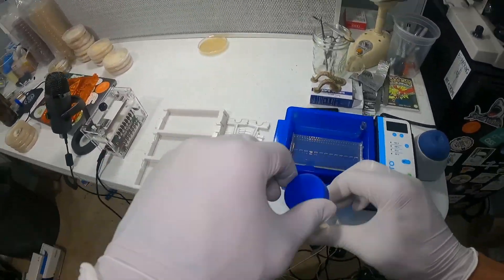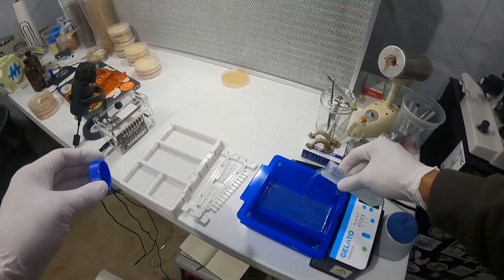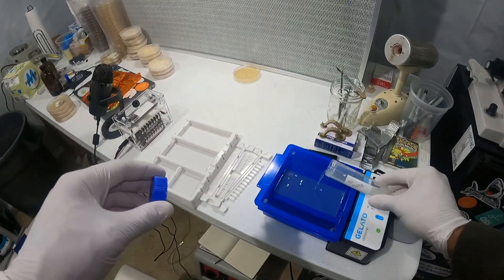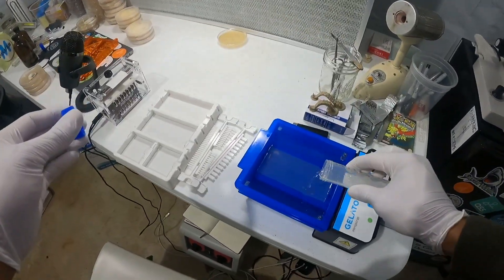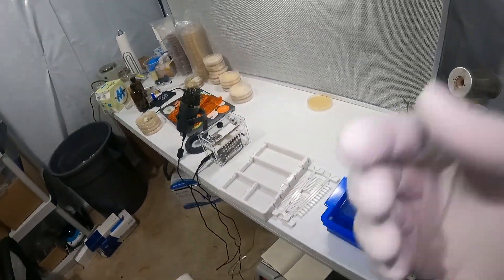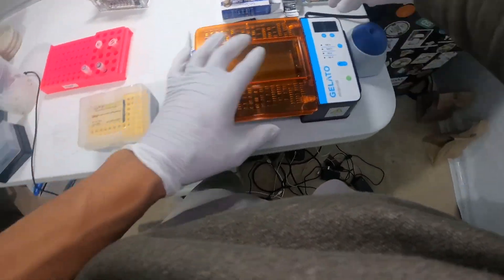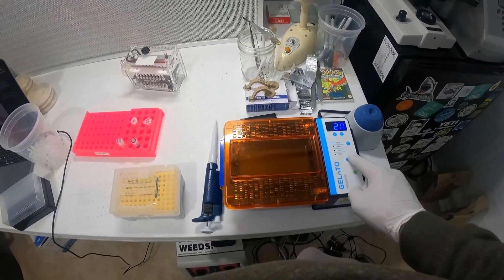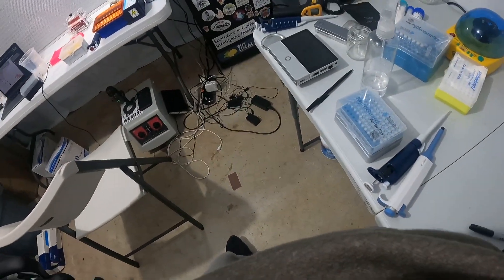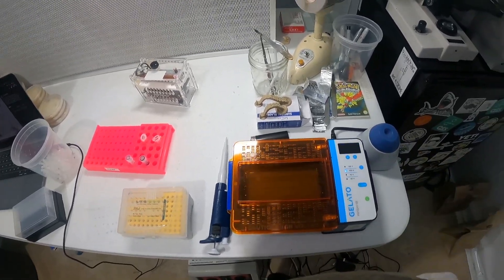At this step, when you put the diluted TBE in over your gel, I was not prepared for how much I needed and had to make some more. I can't remember exactly how much was needed to cover the gel, but it was more than I had on hand. Once I had it covered, I slid the lid in — at first I kept getting an 'open' sign on the digital monitor, but I just had to fiddle with the lid a little bit to get the connections to attach properly, and then it started running the gel.